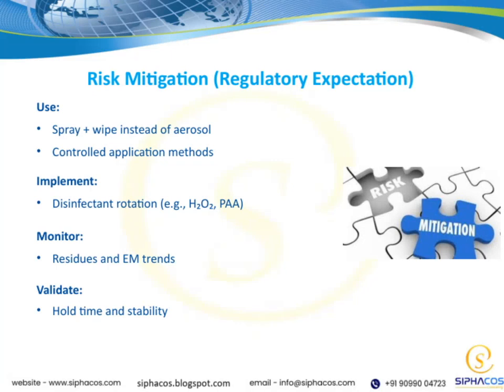Let's talk about risk mitigation from a regulatory perspective. One effective strategy is to replace aerosols with spray and wipe methods. This not only reduces the risk of inhalation or exposure, but also provides more control during application. Speaking of control, implementing controlled application methods is crucial, ensuring disinfectants are used properly to maximize efficacy and safety.